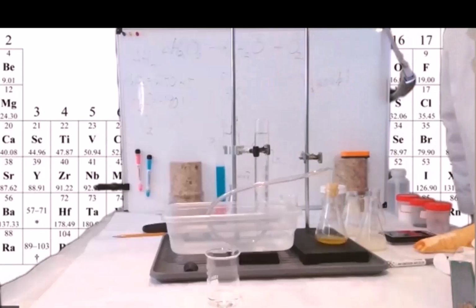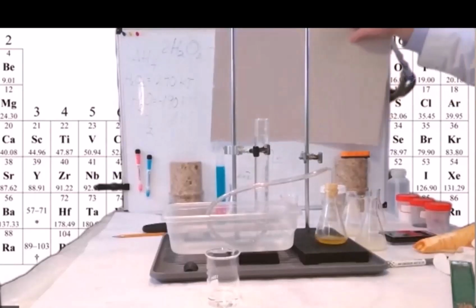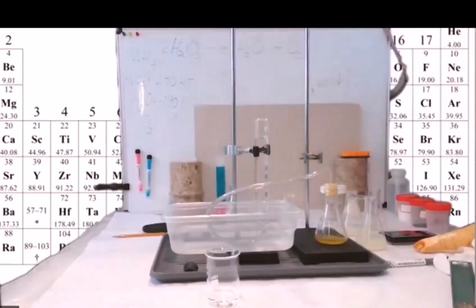And we've collected 10 mLs, and I'm going to say, give me the time at 20. I'll put this here. In the meantime, somehow there's a mechanism that is involved. You can see that a little bit better with that background. 20, time. What was the time? 54:49. Okay, let's make it 54, because, wow, down to the 100th of a second. 54 seconds, that's as good as we're going to get. That was 20 mLs. Now, I'm going to record the volume at 20, 30, 40, 50, and 60.